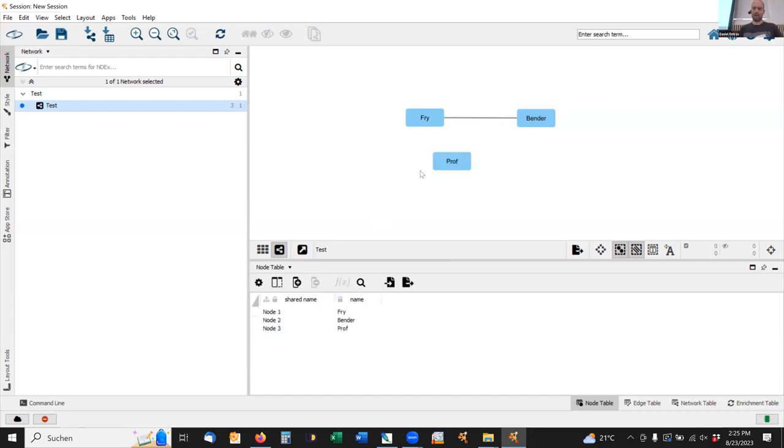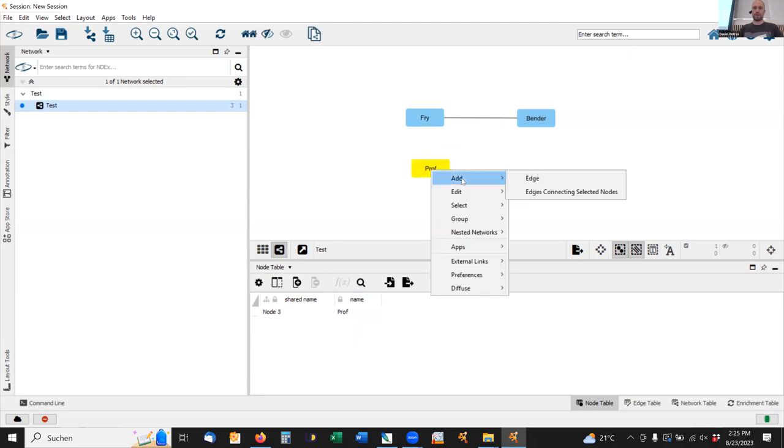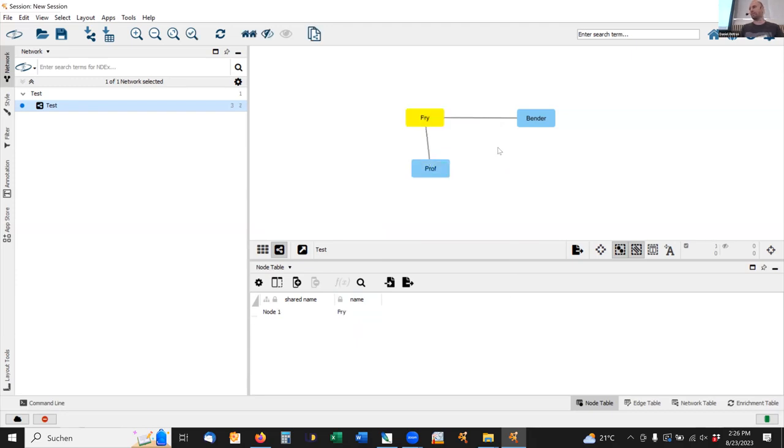So now, obviously, this is going to be very labor intensive if I want to build my spectral network manually like that, or any other network. So I need to somehow import a network more easily. And there again, it's really important to understand the data structure of the files you're dealing with, because then it becomes simpler to modify and debug things, and also to come up with completely new ways of visualizing your data.